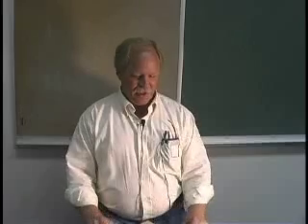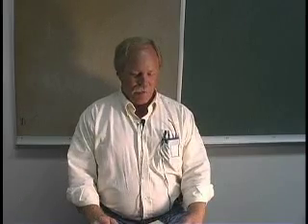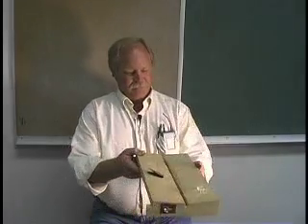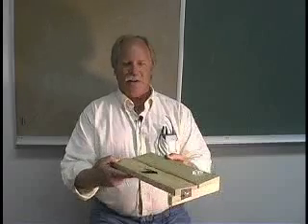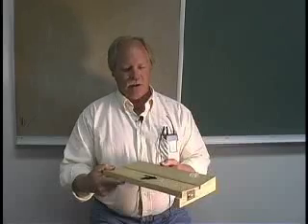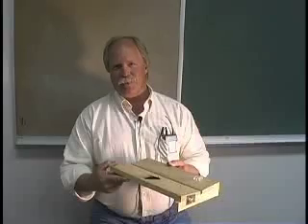And I guess to get started, the first thing you need to do is to have a proper spreading board, and these can be purchased from commercial companies like BioQuip. They can also be made. There's lots of internet websites that will give the specifications for properly constructing a spreading board.